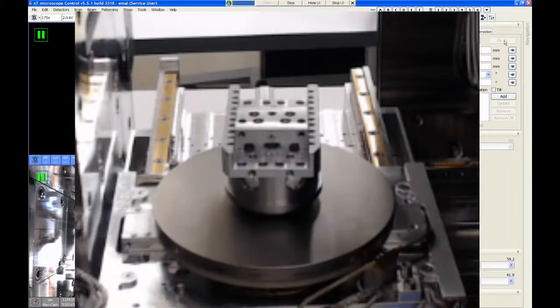Oop, looks like the screw is missing from that one. We have more of these in the lab. So anyway, hopefully you get the idea. There's a lot of little parts that you have to assemble to use this. I think that's the main reason why I don't like it, just because it's kind of tedious to insert and remove. But again, if you like it, by all means, go ahead and use it. If you don't like it, we have other adapters.